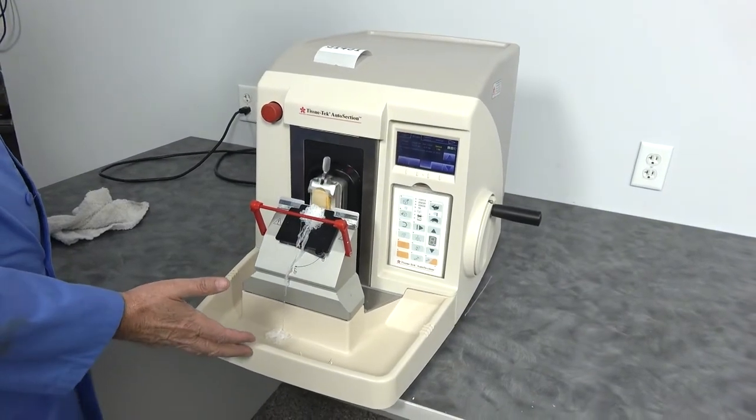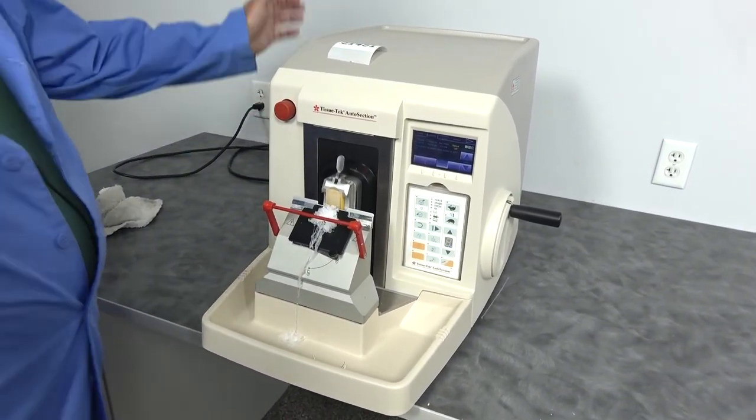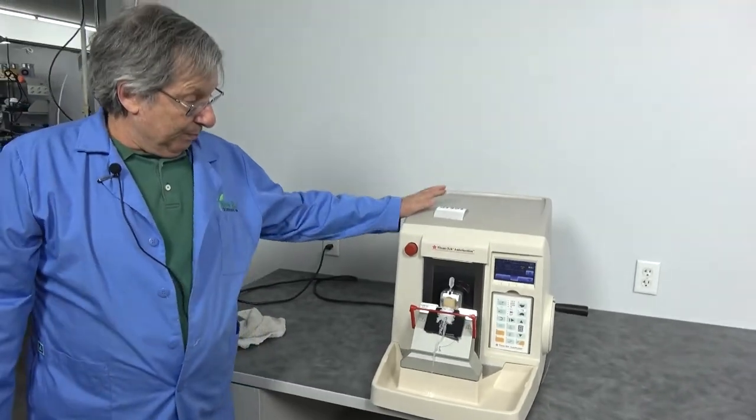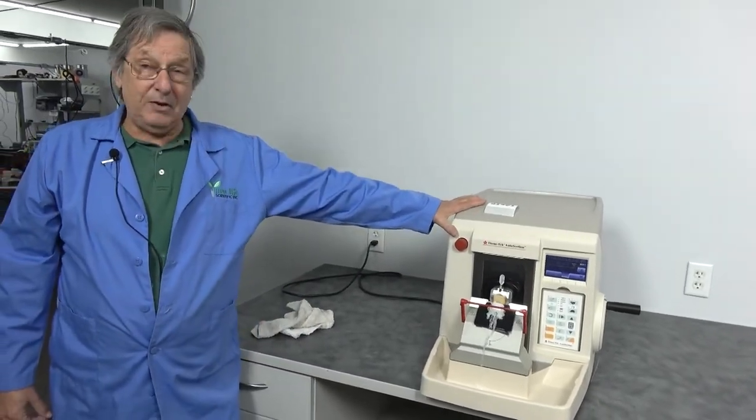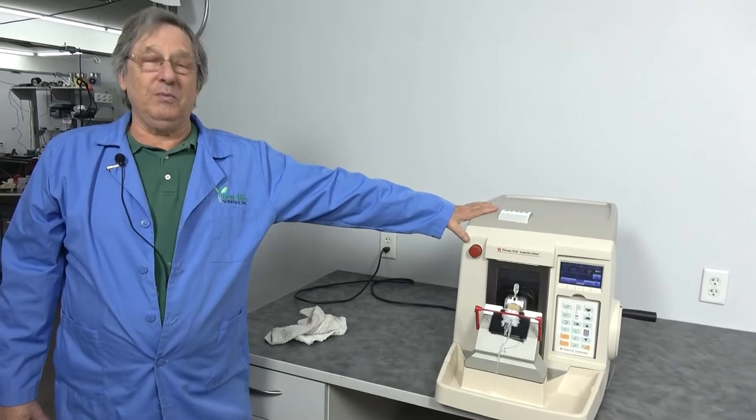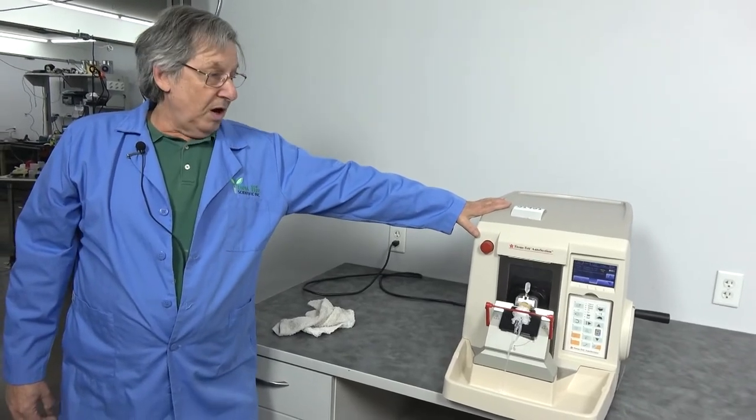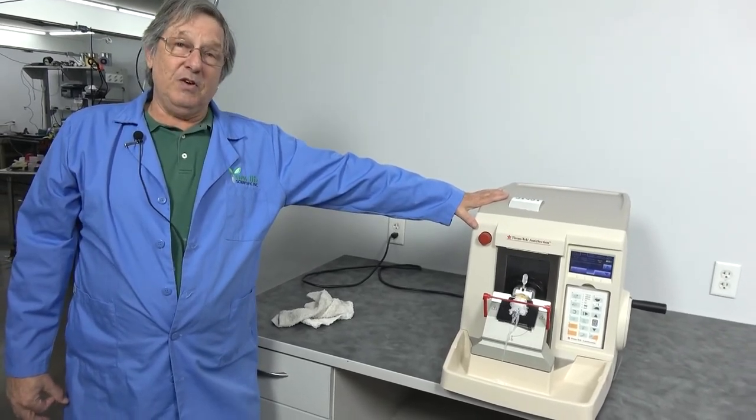These are fairly rare, so I don't think it's going to last long. But when you're looking for a microtome, you might want to check out the Sakura TissueTek auto section. Thank you very much.